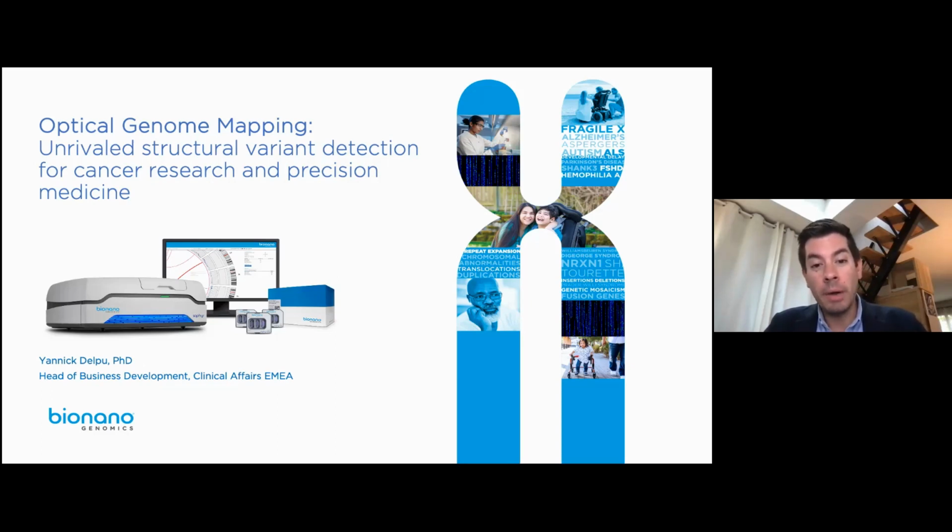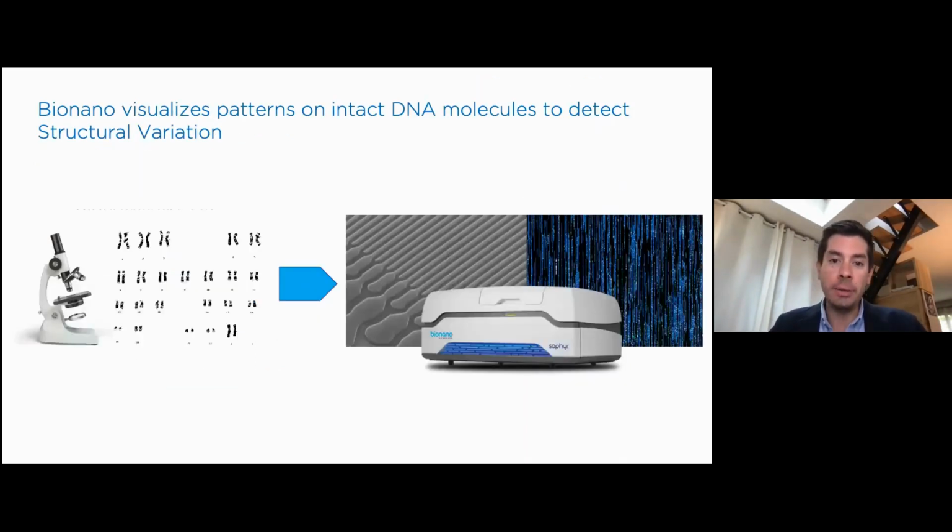Among all biological tissues, cancer is probably the most complicated to interrogate, with genome instability and high cellular heterogeneity. This explains the limitation of NGS to tackle this type of sample, and leads to a lack of understanding of the role of structural variation in cancer as of today.